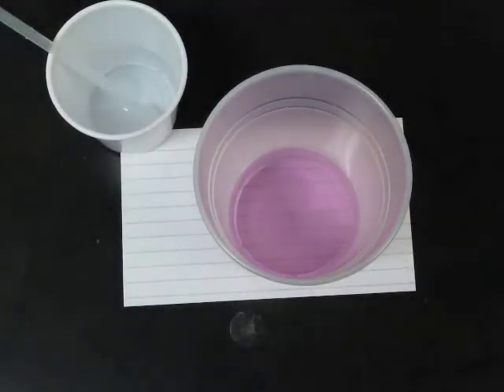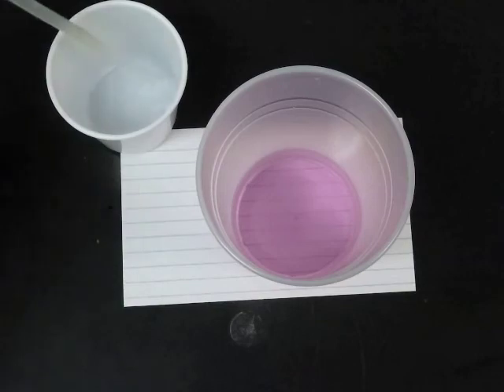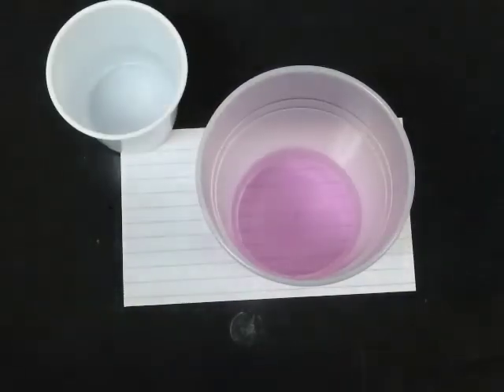So make sure when you're all done that you pour out the cups and you can throw them away, and the little squeezy pipettes can go back in the cup where they came from.